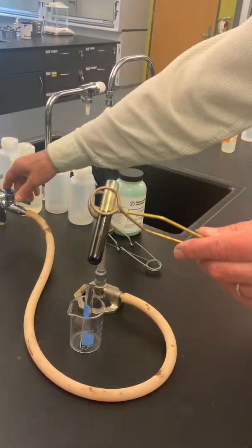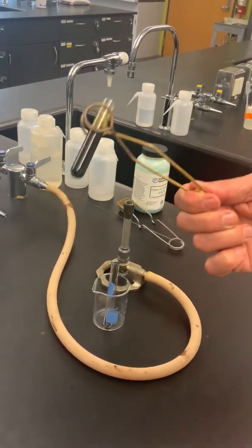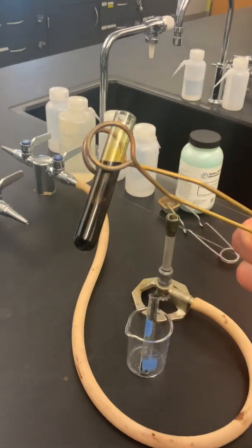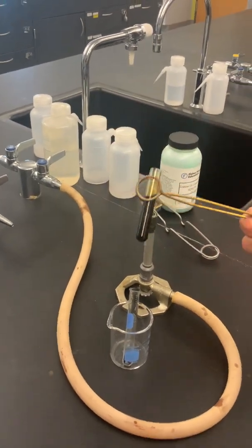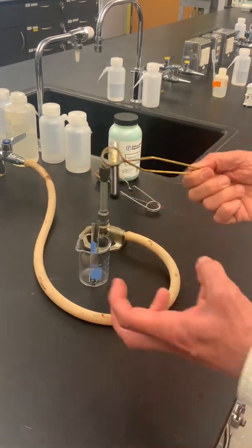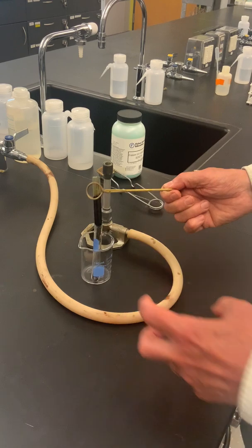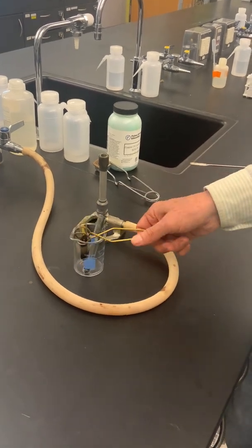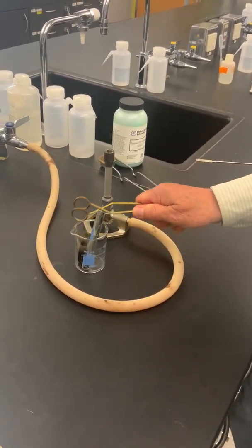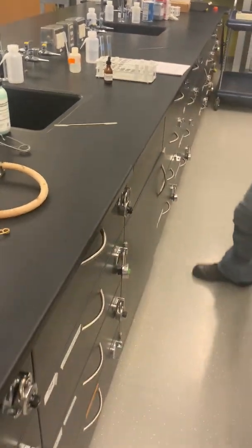I could work with that a little bit more perhaps to make it a little more uniformly black, but that's what we have, the transformation. Again, it's hard to see. If you were here in lab, we'd let that cool and put it down on a couple of paper towels, perhaps hit it with a hammer, and look at that, and we can do that later if we want to. So there you go, reaction number 3.